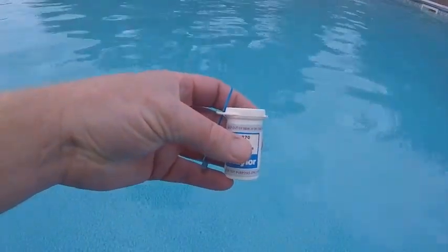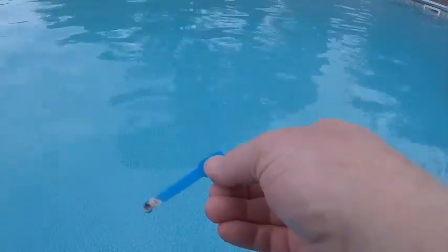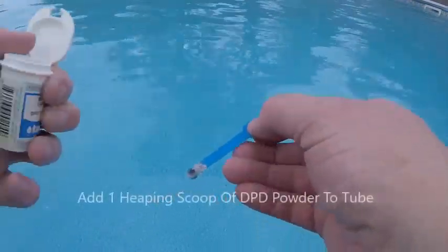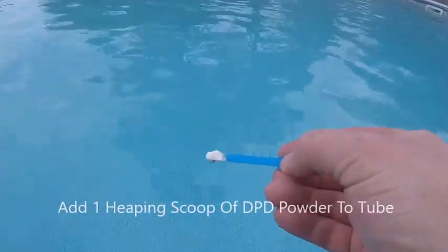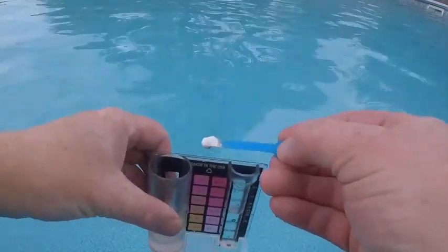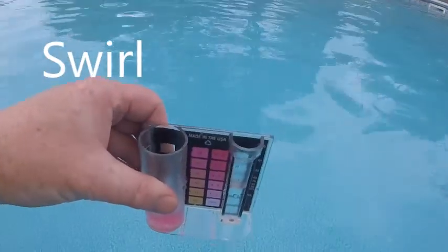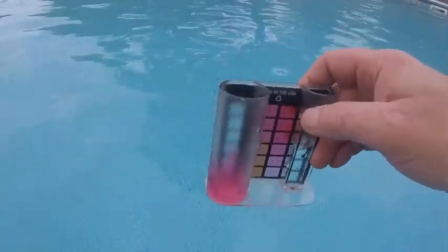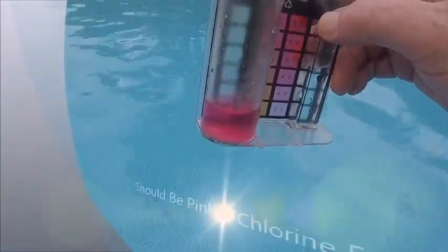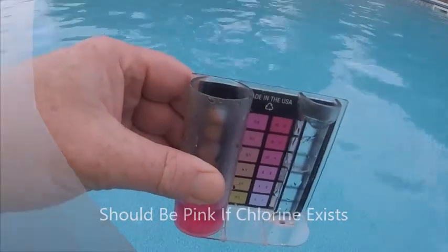Then you're going to get your powder. It should come with this little scoop. Take a small scoop of it like this and place it in the 10 milliliter water — I usually put a little scoop. Give it a stir. If it turns pink, chlorine is present. If it doesn't turn pink, you can try another scoop, or you may just not have any chlorine.